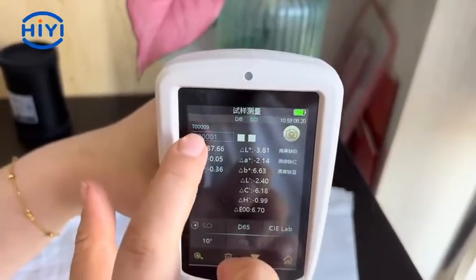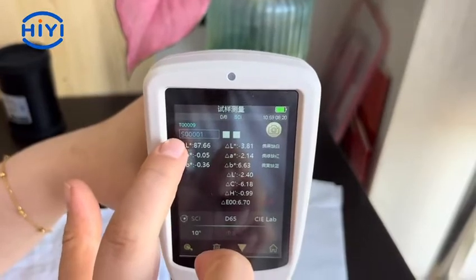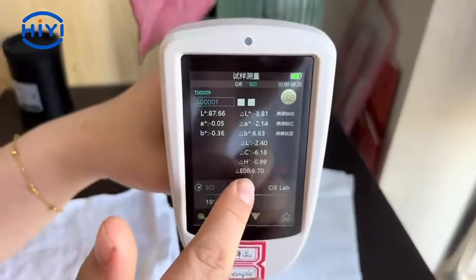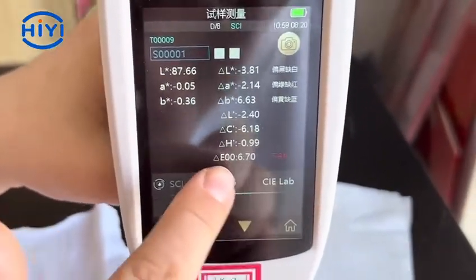We can get the comparison value. Here is the standard fabric color number, and here is the other fabric color number. The AB value on the left is the standard fabric; on the right is the comparison value of the other fabric relative to the standard fabric.